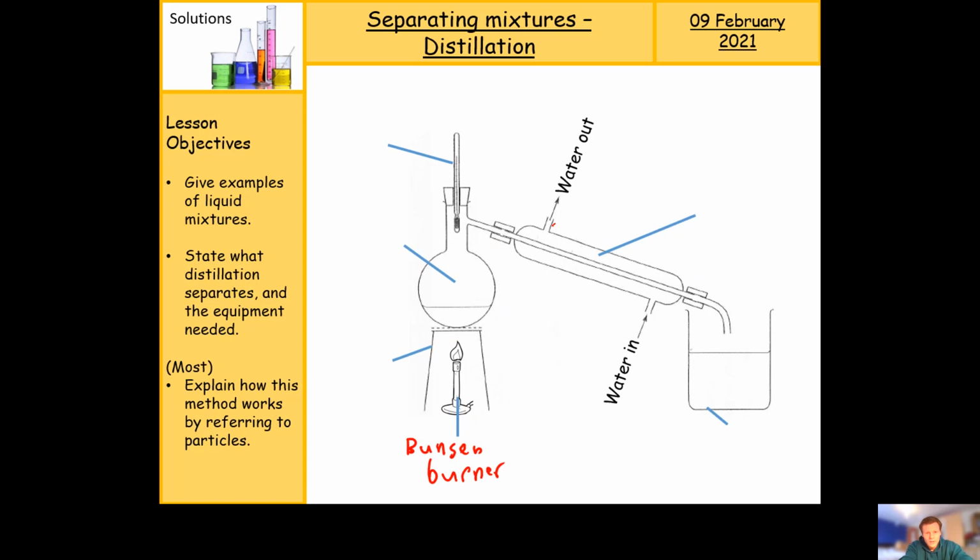And then we've got this stand up here, which in the diagram is tricky to draw, but we know in reality it has 3 legs. So what's the 3-legged stand called? If I try to draw it in 3D, it would look something like this. And that then is our tripod. Tri for 3, like triangle has 3 sides, pod for feet.